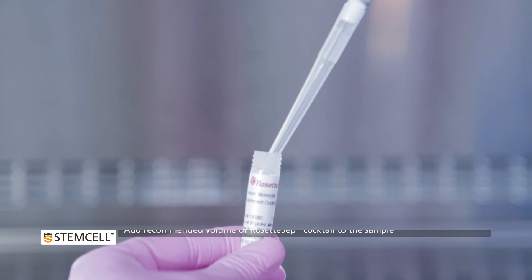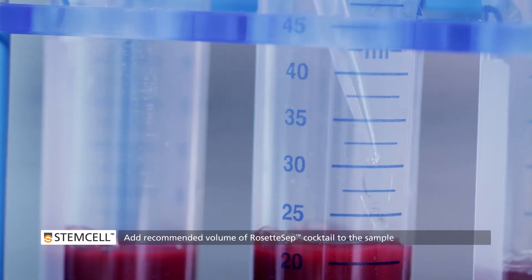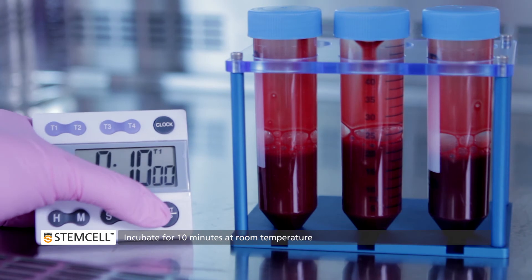To isolate purified cell subsets, simply add the recommended volume of the appropriate Rosette CEP cocktail to the sample. Mix the sample well and then incubate for 10 minutes at room temperature.